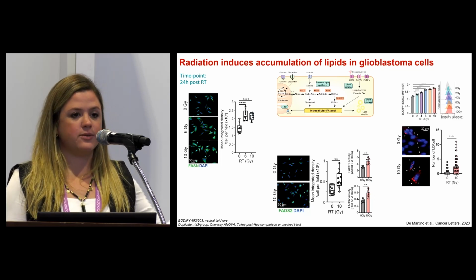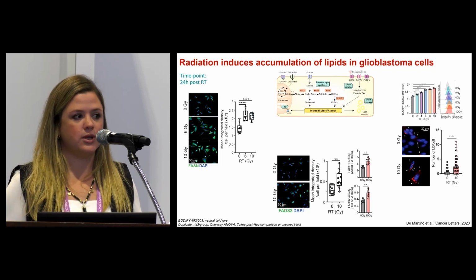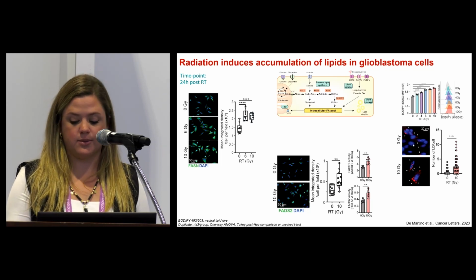Finally, as I mentioned, these fatty acids can be stored as lipid droplets, and what we found is that radiation is also inducing accumulation of these lipid droplets by flow cytometry, and we could also detect them by immunofluorescence.